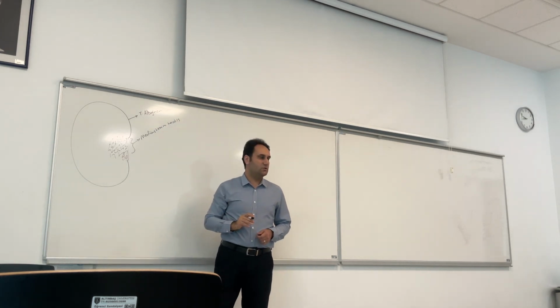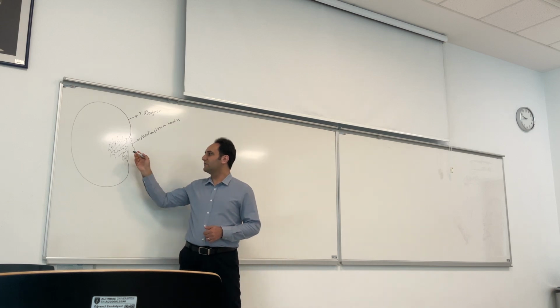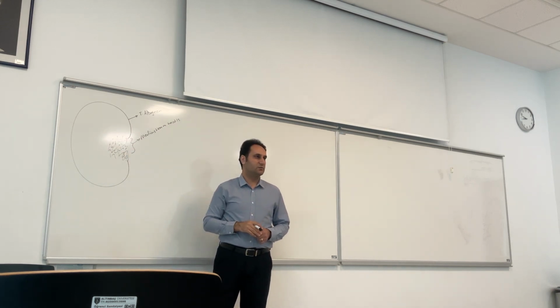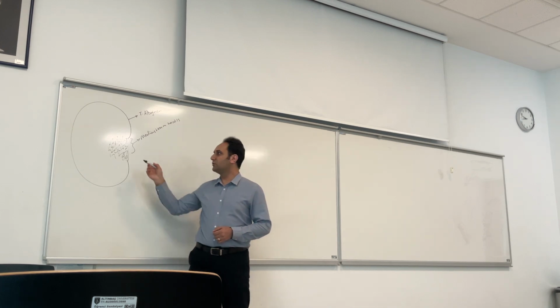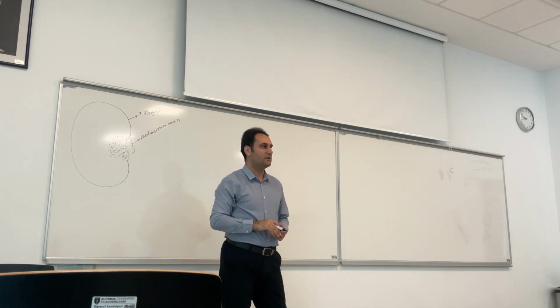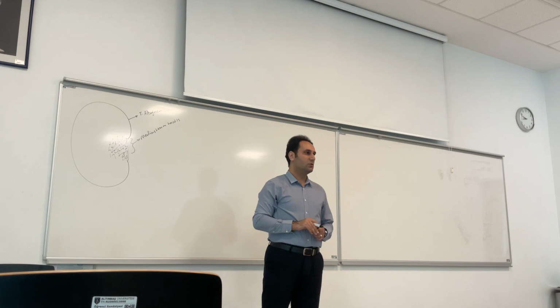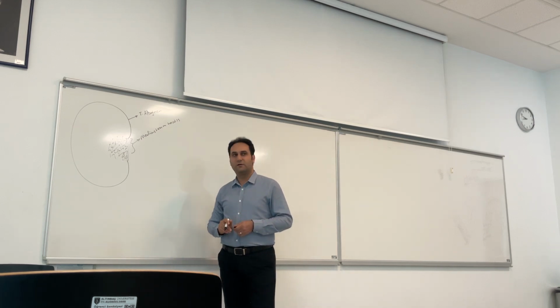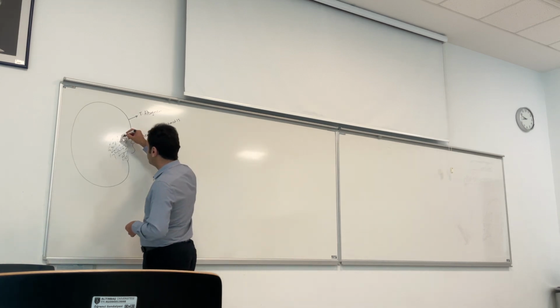This connective tissue sends some extensions, or trabeculae or septa, into the inner side of the testis and divides the testis into 200 to 250 different sections like this.